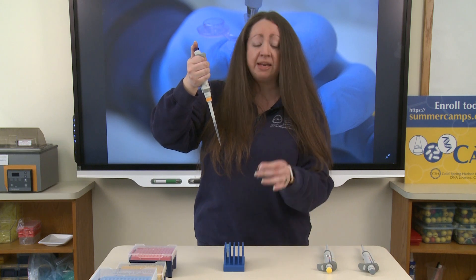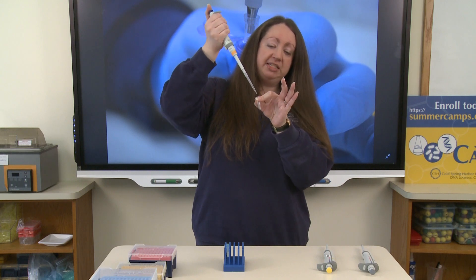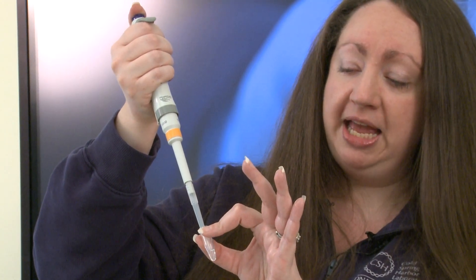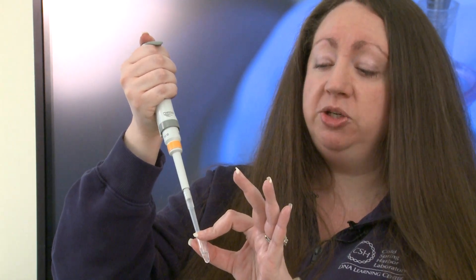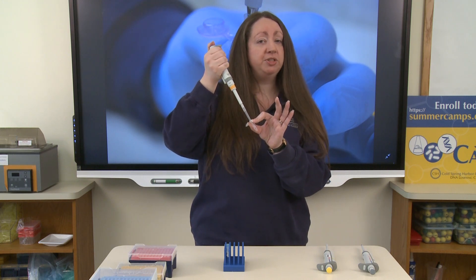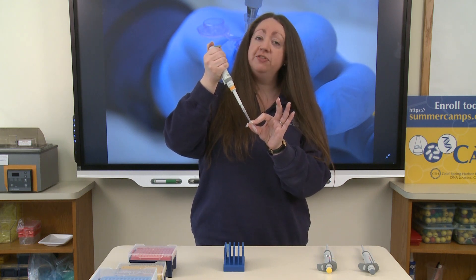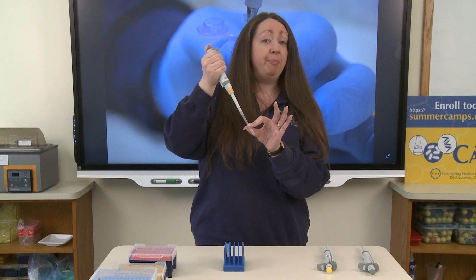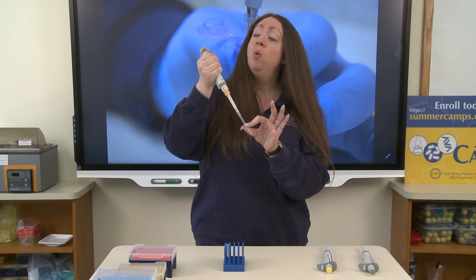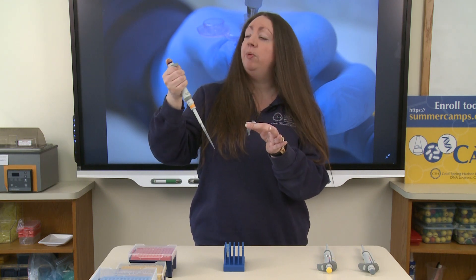No bubbles here, so that looks good. Now transfer the liquid into the microfuge tube by placing the pipette tip inside. To expel the liquid, slowly press down to the first and then the second stop. You may push air bubbles into your reaction tube — that is okay. We just don't want to push air bubbles into your original reagent tube. When finished, keep your thumb pressed down on the plunger, pull the pipette tip up and out of the tube, and then release your thumb.